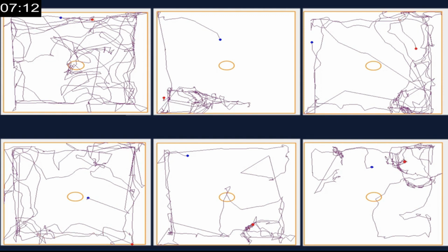In this experiment, the motion tracking software should record how long it took for the rats to go to the food for the first time, meaning you have to record the first food touch latency time. Second, the distance traveled by the animals should be measured.